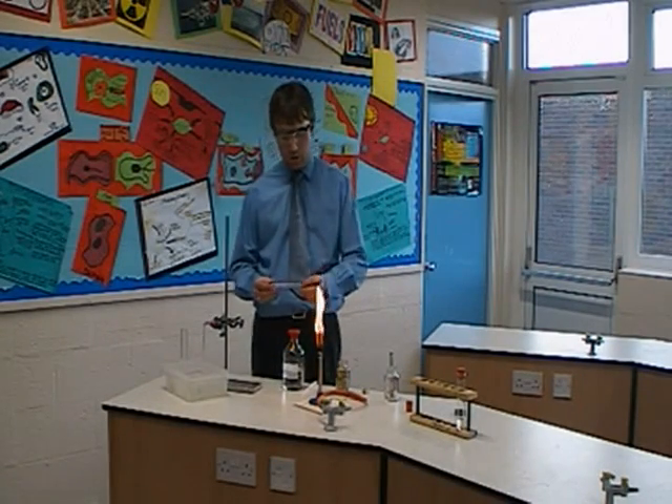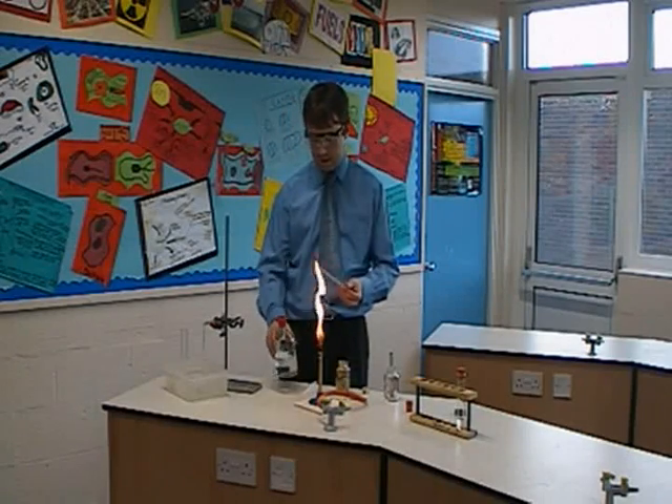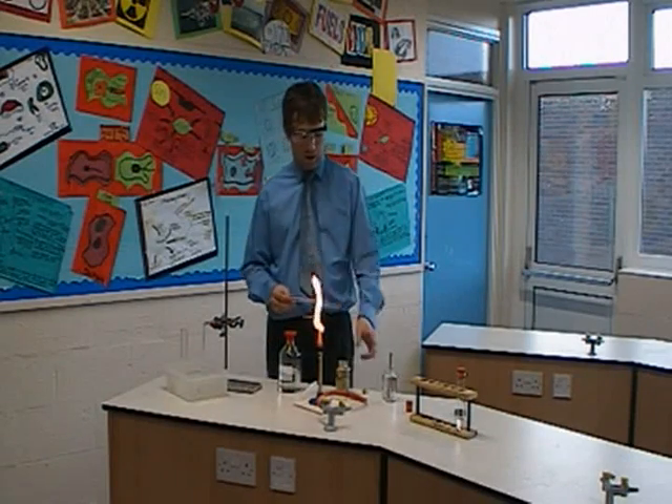What we're going to do with this experiment is to crack an alkane, and we're going to use paraffin as our alkane to crack. We're going to crack it using heat, so it's thermal cracking, using a catalyst.